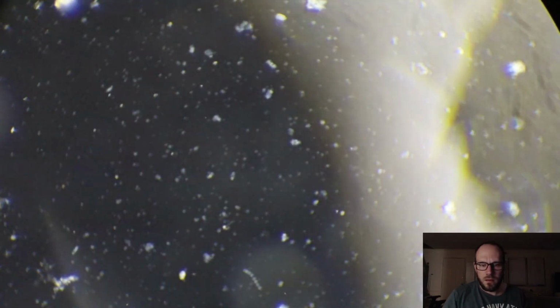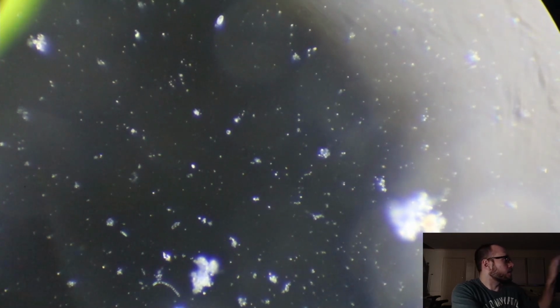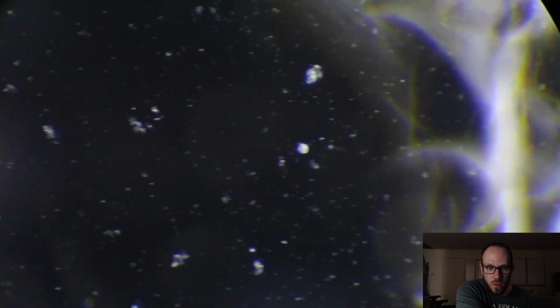I think I know what the problem is. The moss pushes up on the... Oh, it might also just be the fact that I have this on +1 exposure. Let's do this. See if that... No, it's... If anything, it made it... Oh, that actually helped the contrast. Yep, there's another flagellate. You could tell because he's moving super slow.